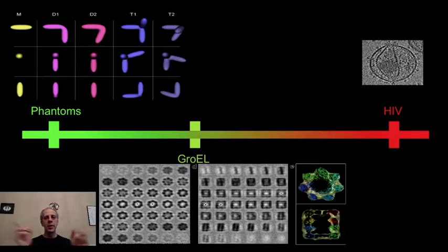Now, you have an algorithm. You develop this image processing algorithm, and you're going to use it to detect the three-dimensional shape of the envelope in the HIV virus. But then you say to yourself, how do I know if my algorithm works? Nobody has ever seen the envelope at the resolution that I want to see it. So how can I validate? And this is very important when you're talking about medical imaging, because you don't want to make a mistake and mislead, let's say, a complete vaccine development because you made a computational mistake.